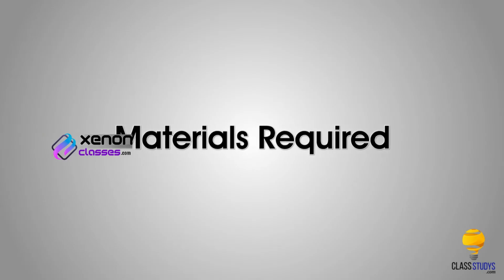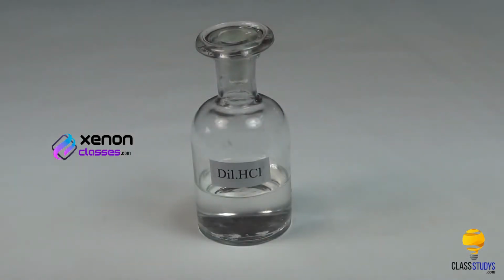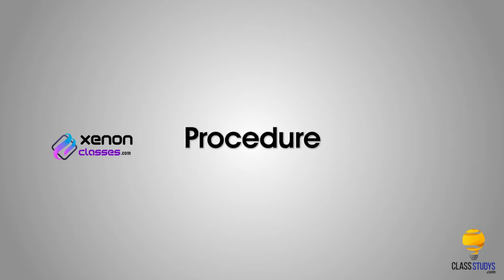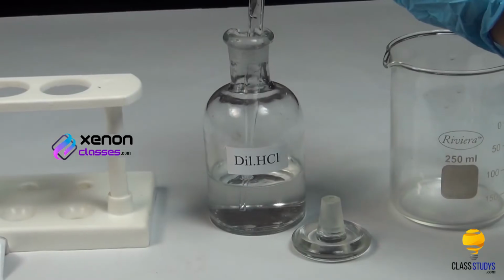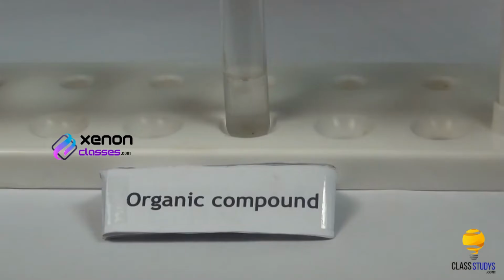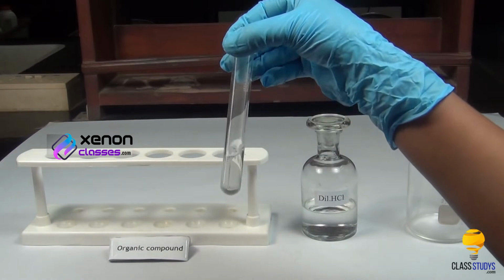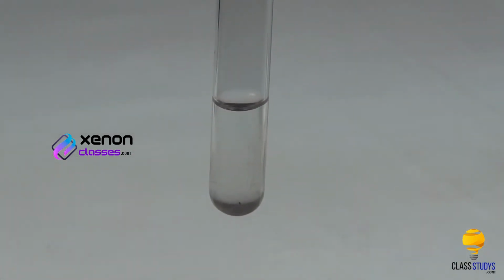Solubility test. Materials required: organic compound, dilute hydrochloric acid and dropper. Procedure: take a small quantity of dilute hydrochloric acid using the dropper. Add it to the test tube containing the organic compound. Shake the test tube well. Amines have appreciable basicity, so they dissolve in mineral acids.